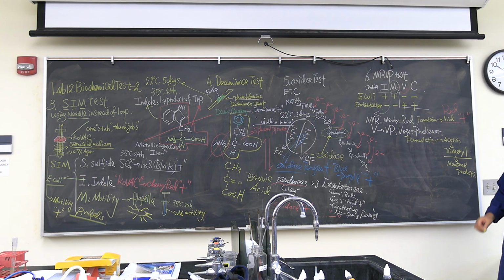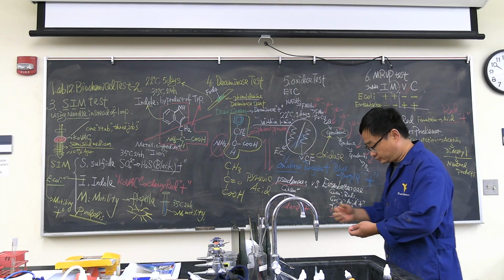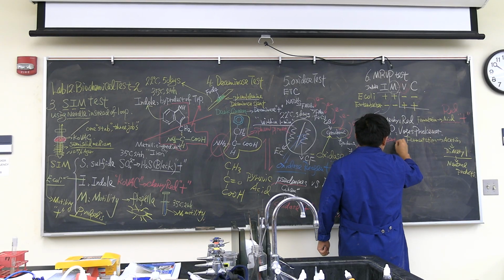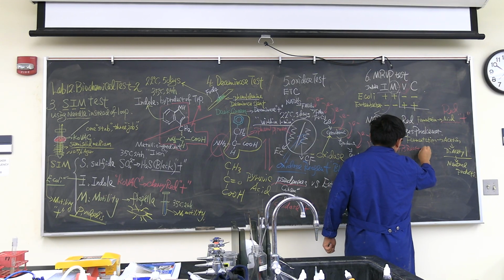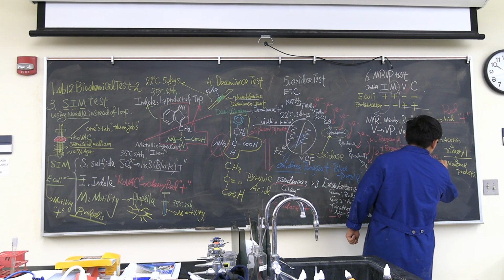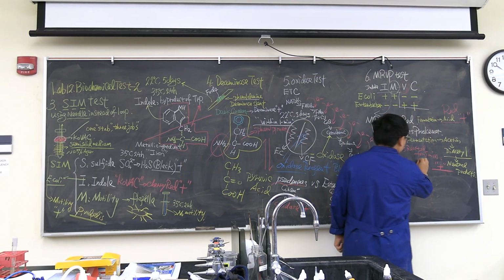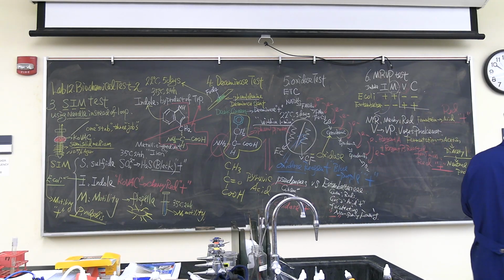Now how are we going to do it? With the same tube, we pour half of it out and we add reagent A and reagent B, and let it react for 5 minutes. If you see it turns red color, it is positive. Otherwise, it's negative.